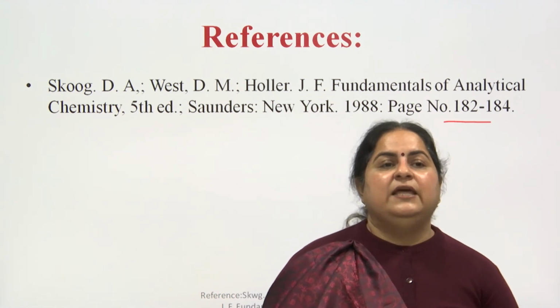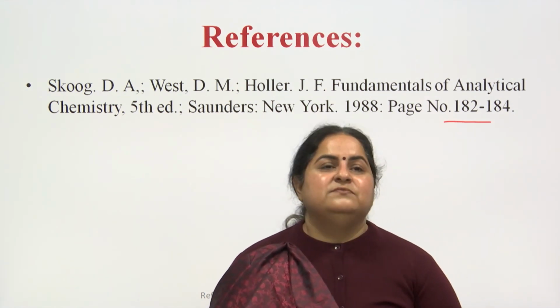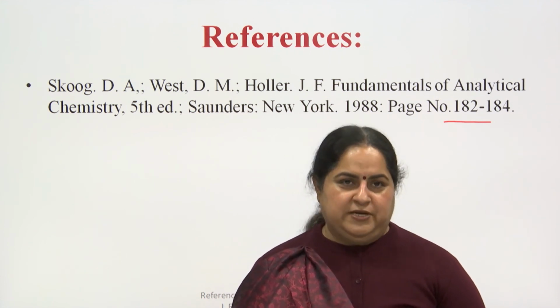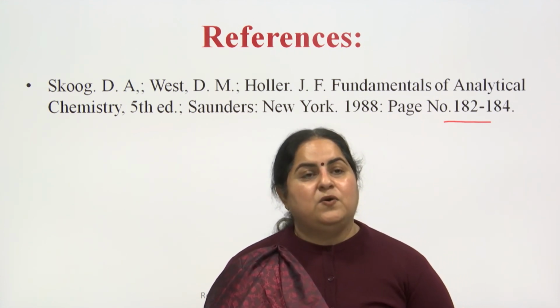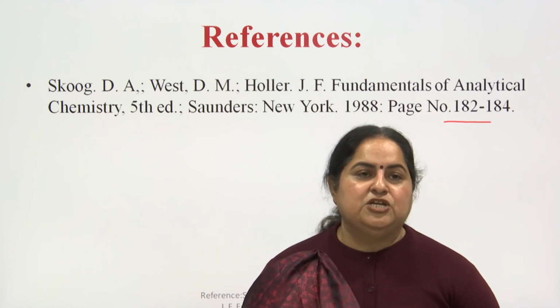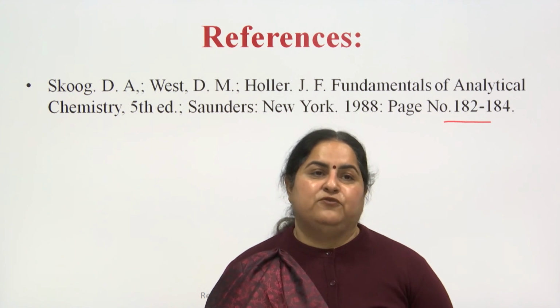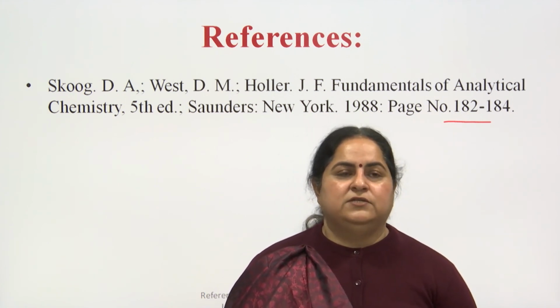So, this technique has gained new success since the addition of the spectrophotometer. Now it is also a determination method of choice due to the addition of spectrophotometers, right, and these are the references. You can follow this book.